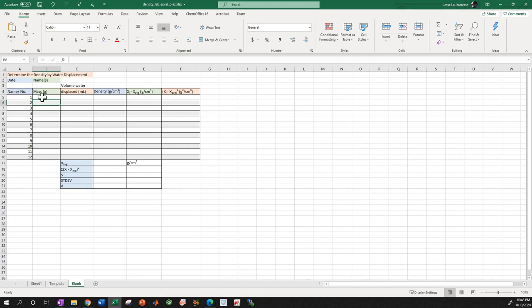So for this, hey, we have mass. It's good to preface. In this lab, you will have some other video going through the lab itself. We're going to be taking Teflon balls. Teflon is a fluorocarbon, so it's like a hydrocarbon, but fluorine's where the hydrogens normally are. And so your frying pan has Teflon on it. That's why things don't stick to it. It's a very inert thing that doesn't want things to interact. It's kind of doing its own thing.